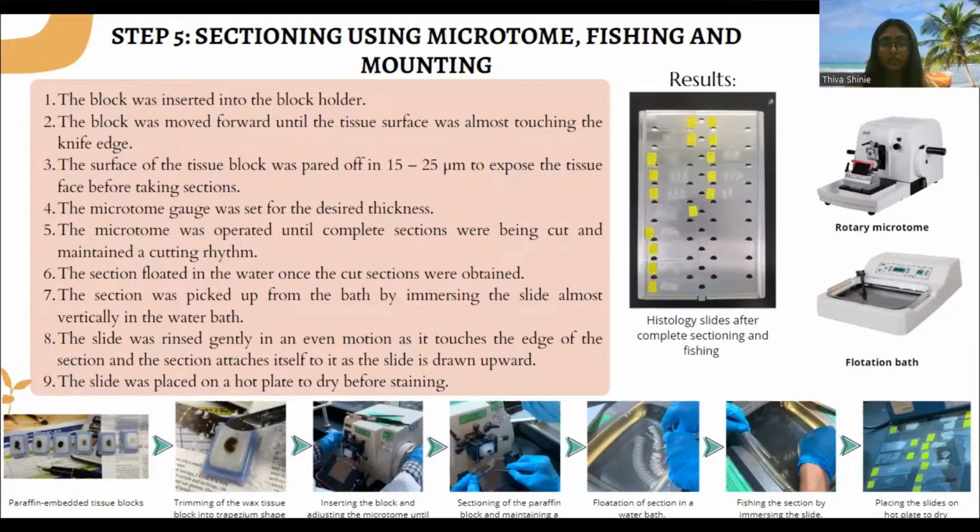The image in the result shows the histology slides after complete sectioning and fishing. The bottom figure shows the detailed flow of this process with captions.